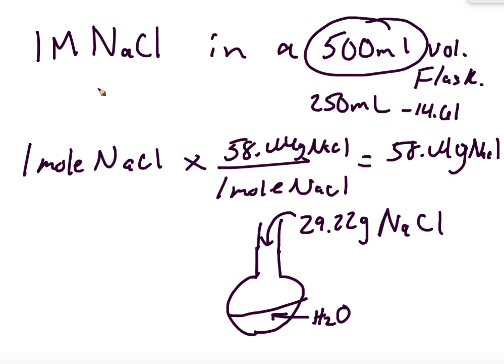How about if we only used a 100 milliliter volumetric flask? You know, we'll stop at 250. And that's all we'll use. We use 1 liter, 500 milliliter, and 250 milliliter volumetric flasks.